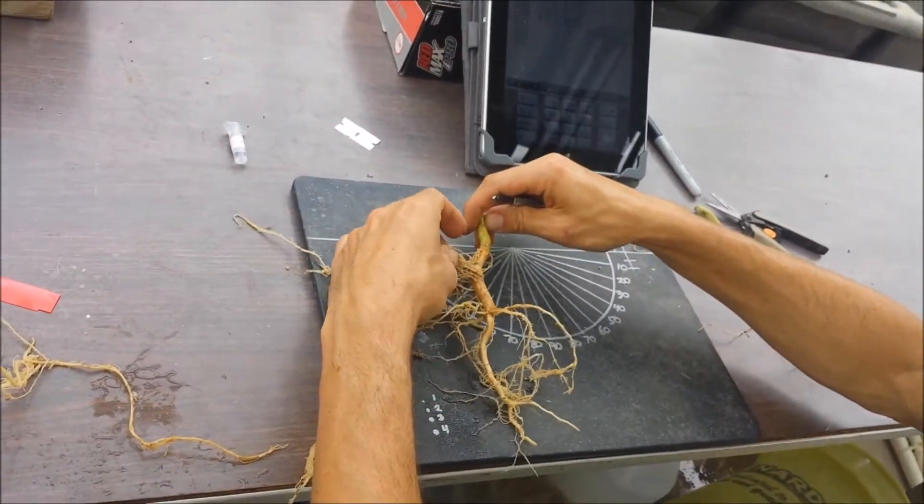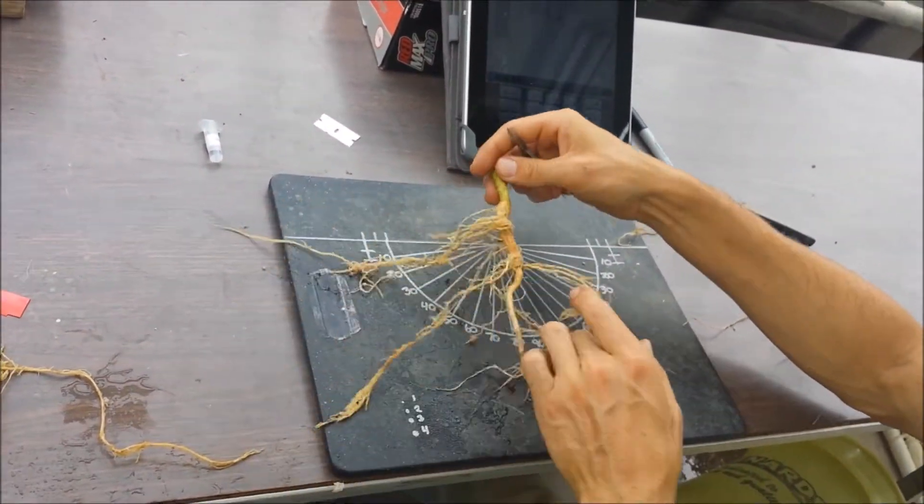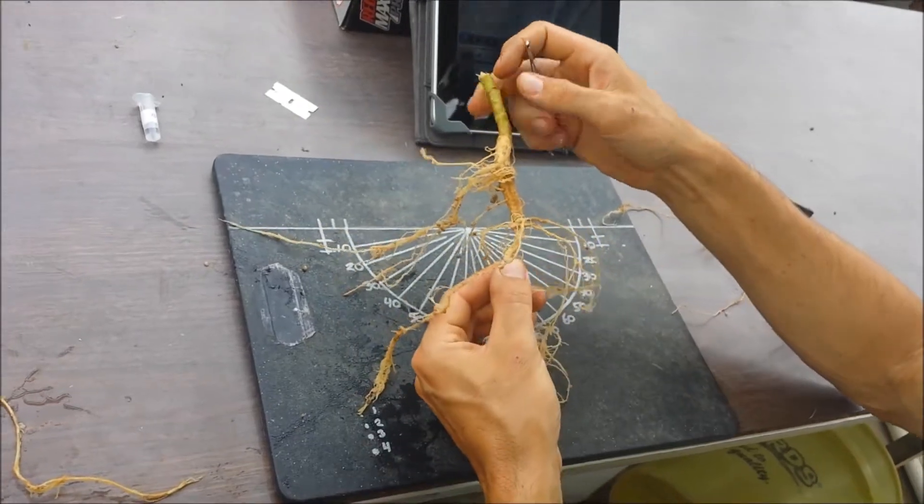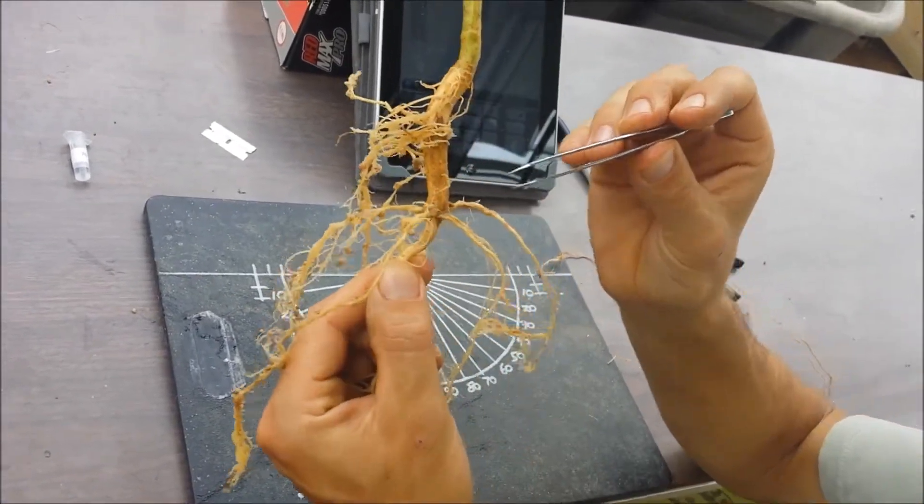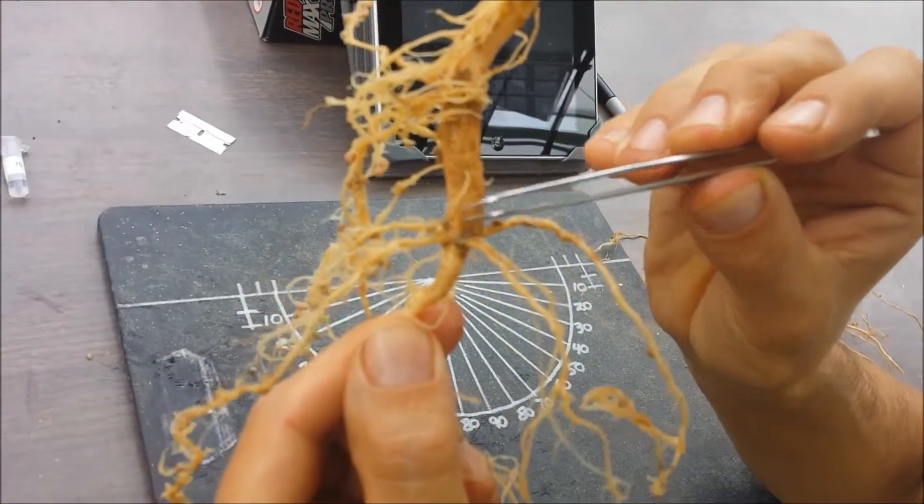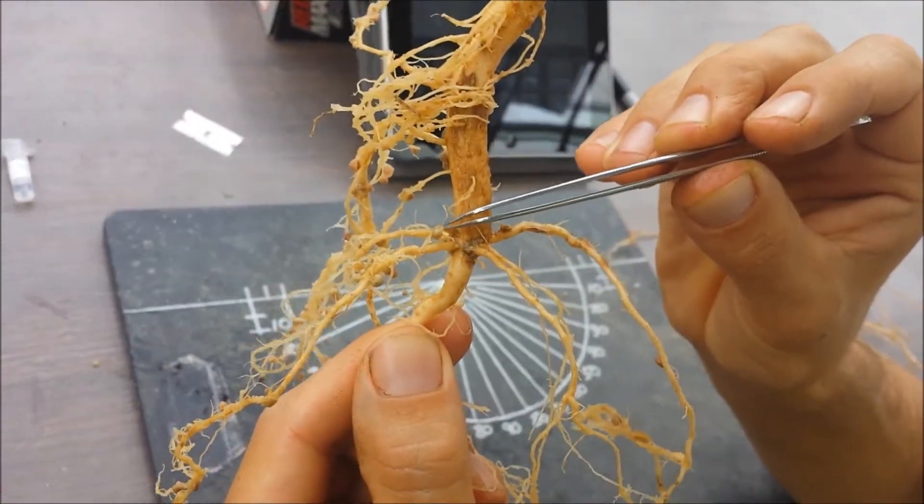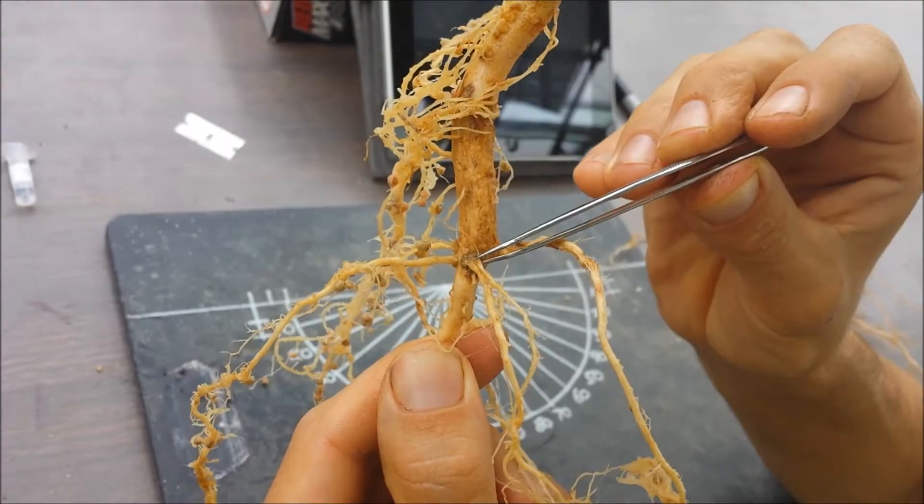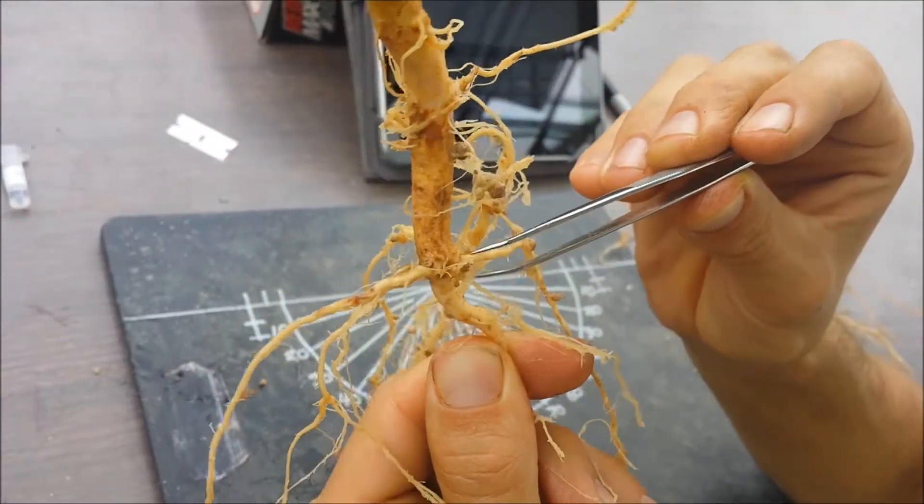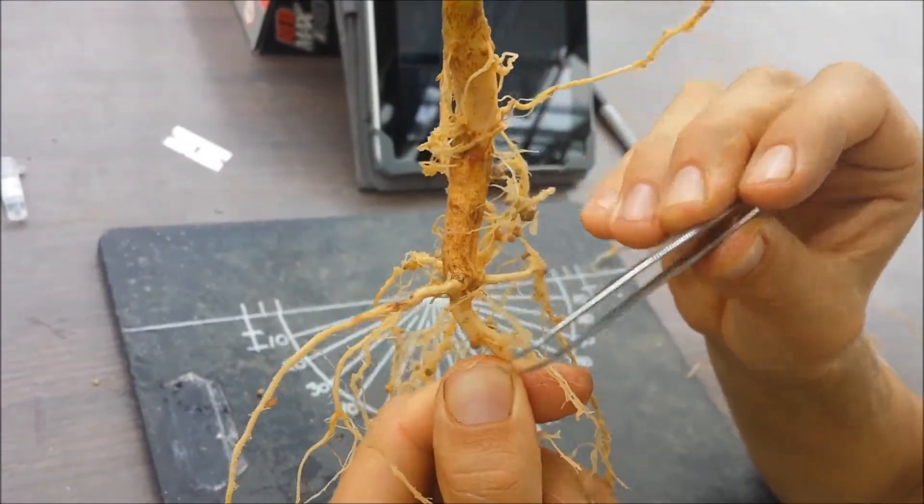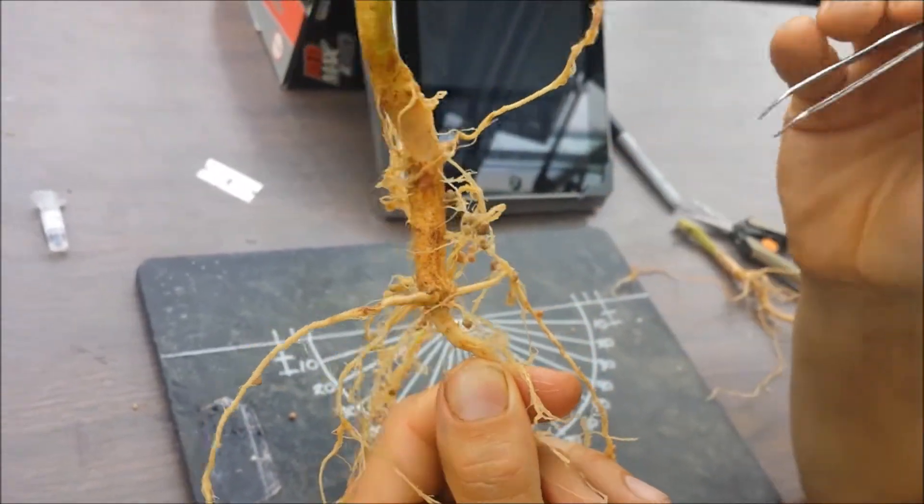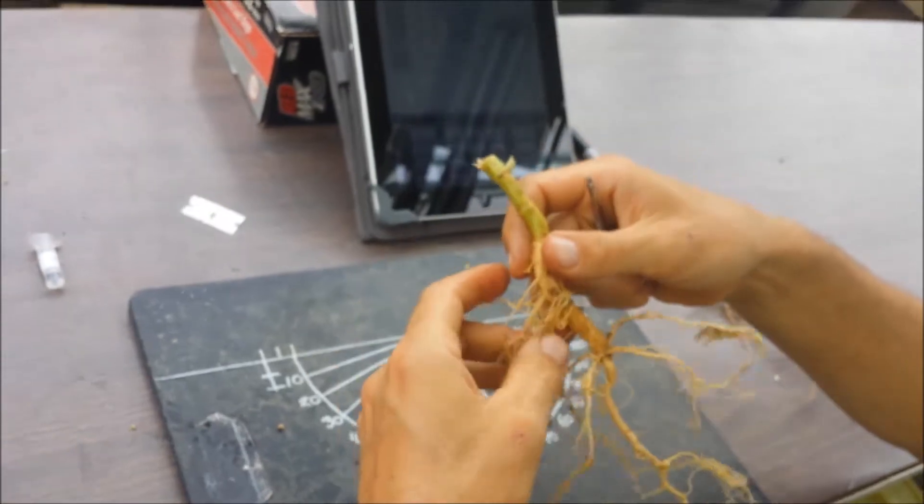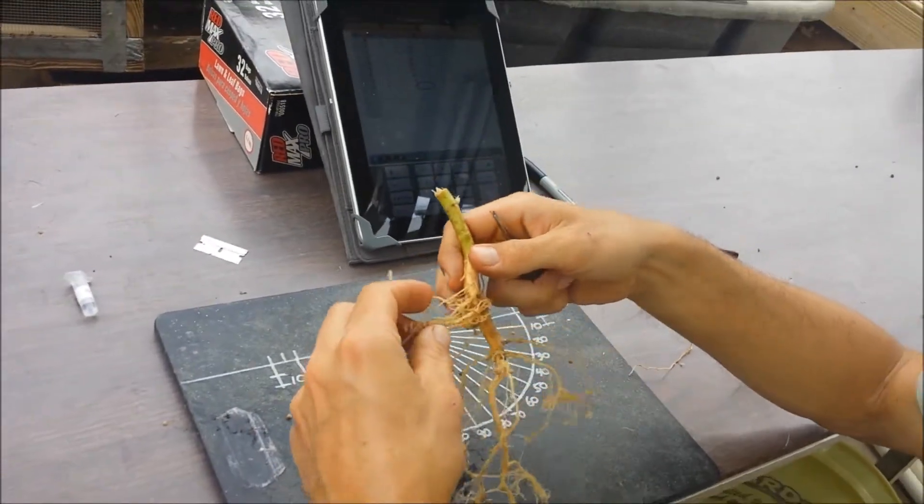I generally start with the observations of the basal roots. So I first count the number of whorls, which in this case are two. You can see that. This is one phyle, and this is the first whorl, and that's the second whorl. And in this location, there's only one root occupying that phyle. So that would be two whorls and seven basal roots.